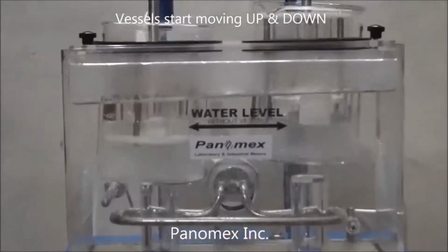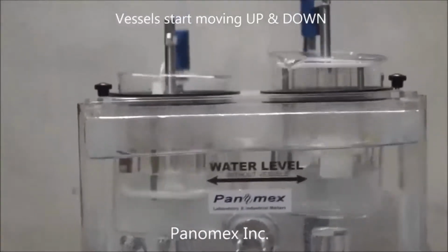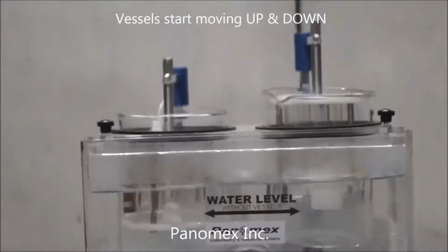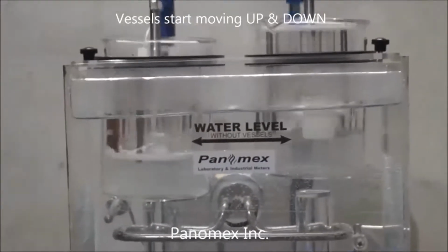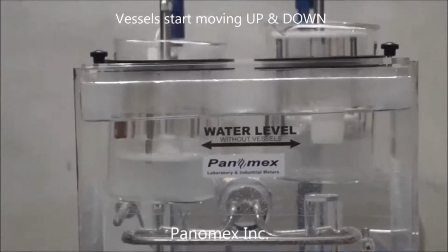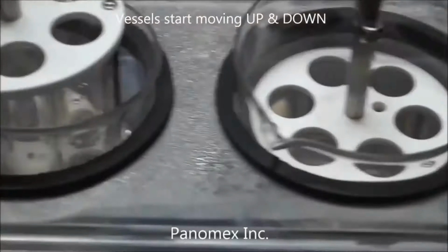These vessels will start moving up and down, because these conditions happen in the stomach. So under this temperature only, we have to wait for the disintegration test.